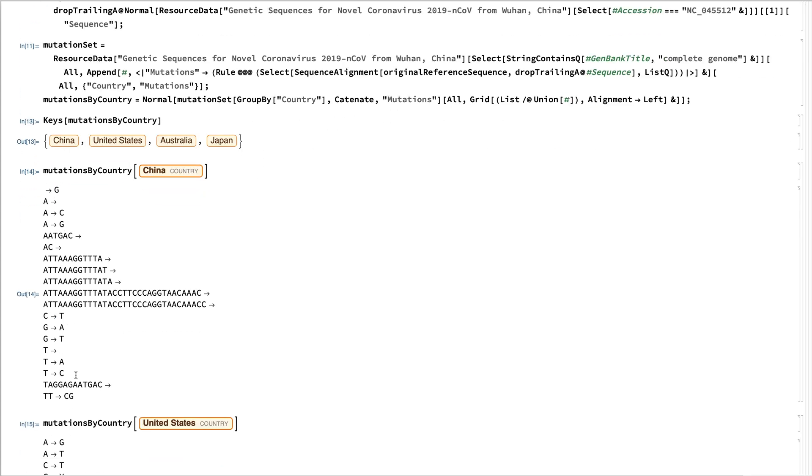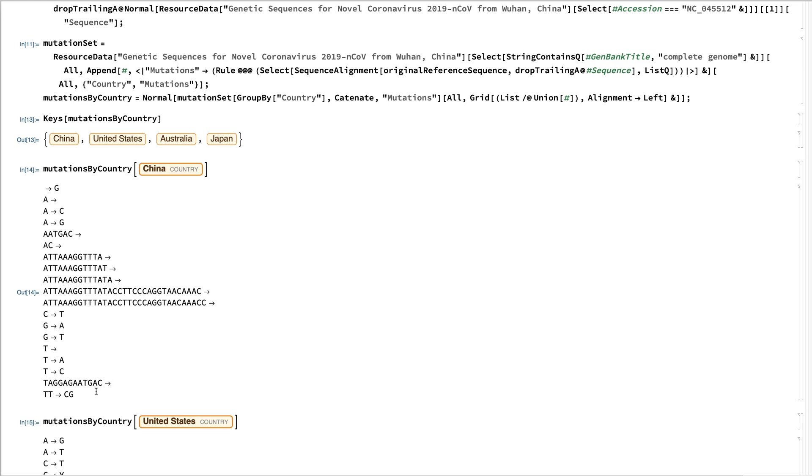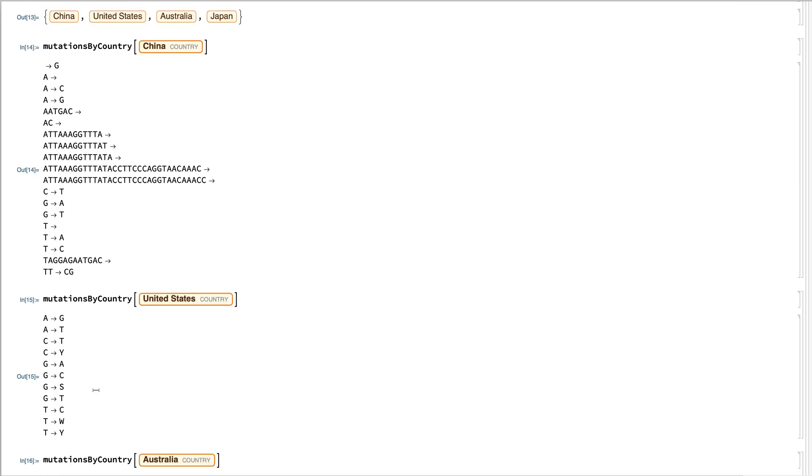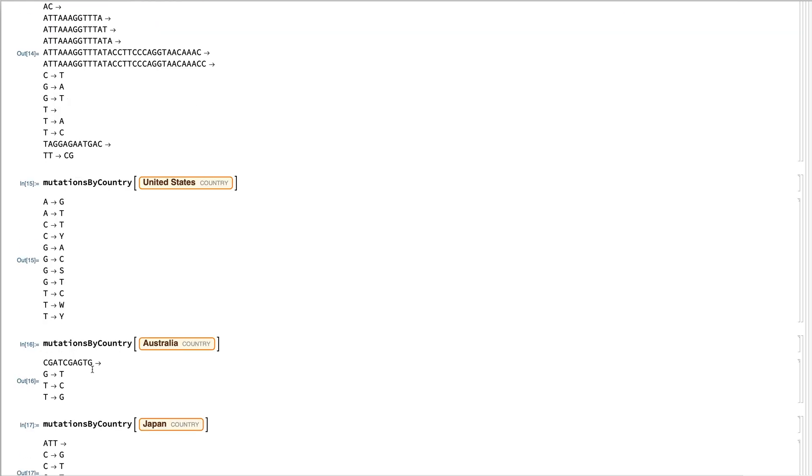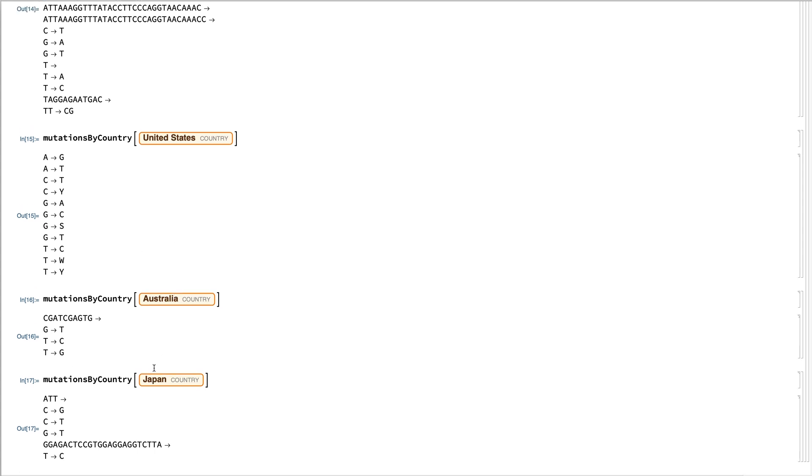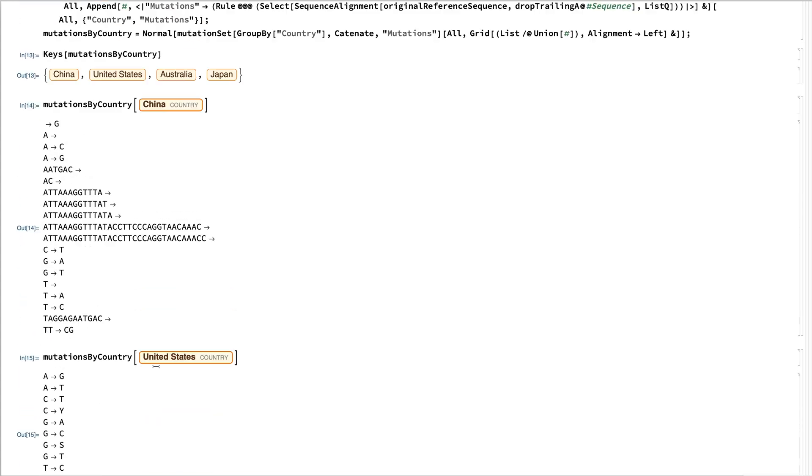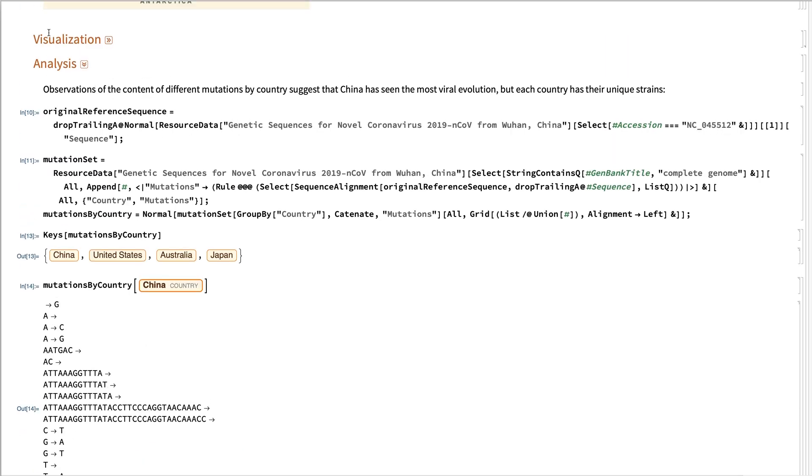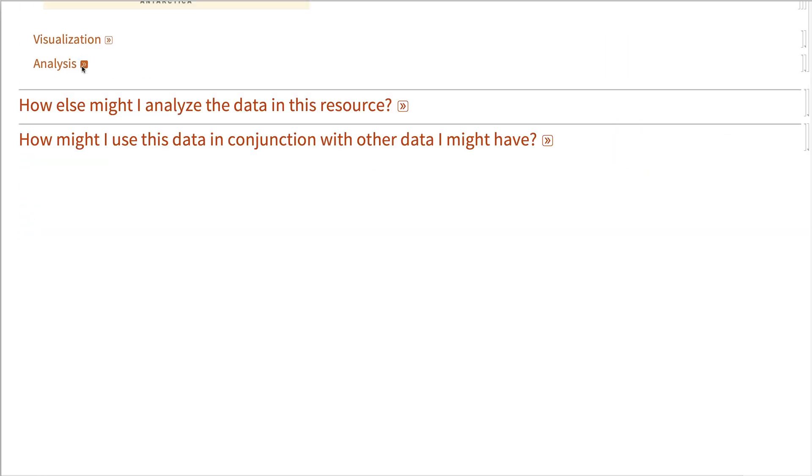So here we see a fair number of mutations for China and a smaller but different mutations for the samples for United States, Australia, and Japan, showing some of the viral development.